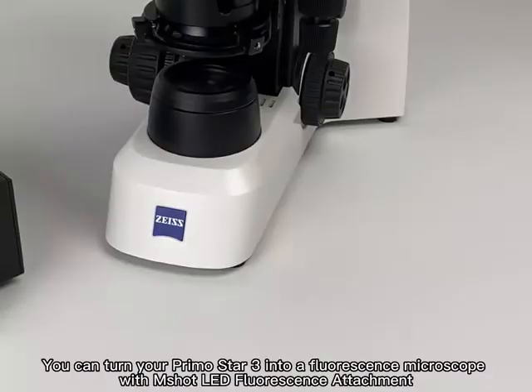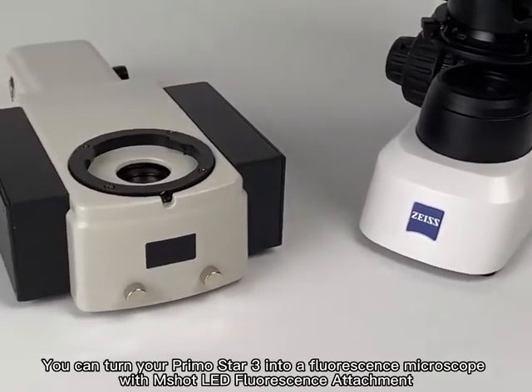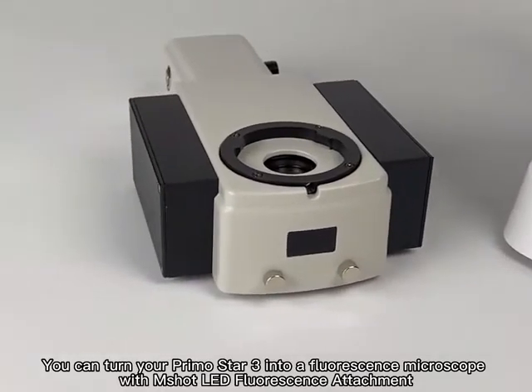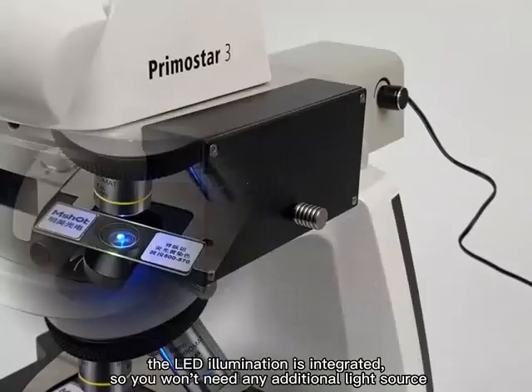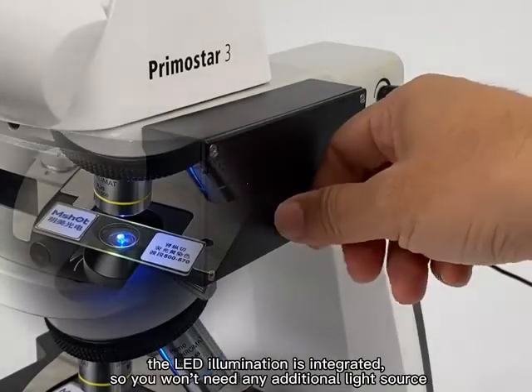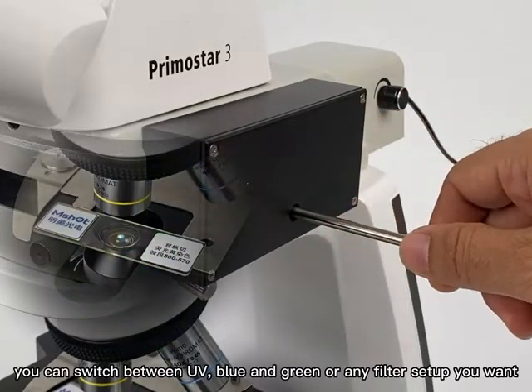You can turn your PrimoStar 3 into a fluorescence microscope with the M-Shot LED fluorescence attachment. This module comes with up to three fluorescence channels. The LED illumination is integrated, so you won't need any additional light source.